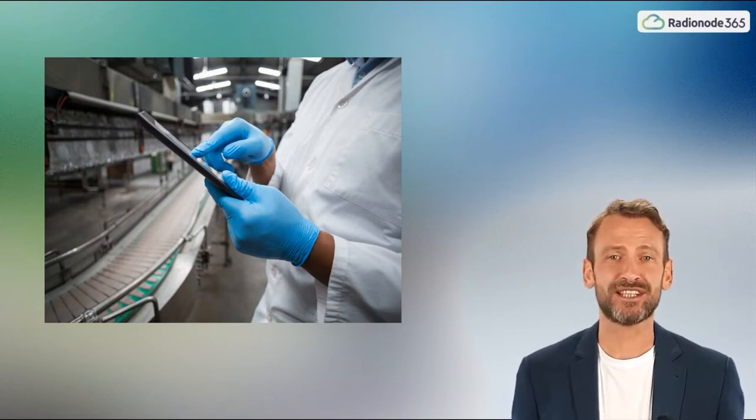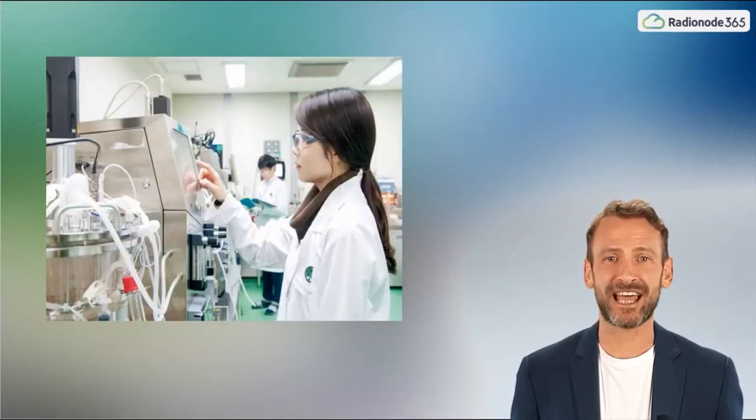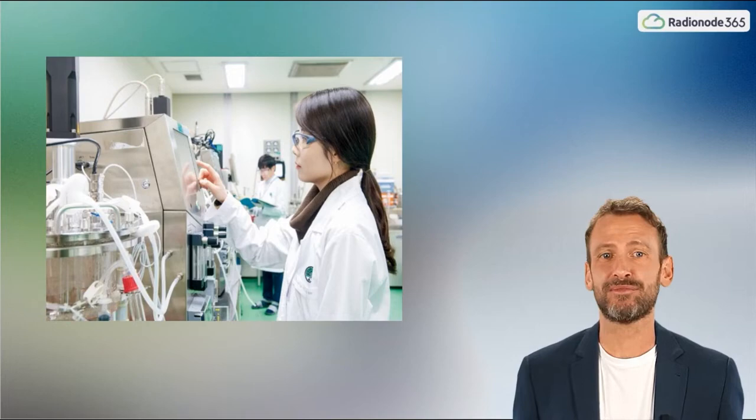Our Radionode365 functions previously only managed the lowest and highest temperatures, but the recently introduced functions can periodically monitor and give a detailed report on the period for which the appropriate temperature was not maintained, and this can be stored up to 3 years. So if there is a need to use a data logger in your application, similar to the one recommended by CDC, Radionode365 has the best management method complying with Title 21 CFR Part 11. Shall we take a look at the Audit Trail function of Radionode365?